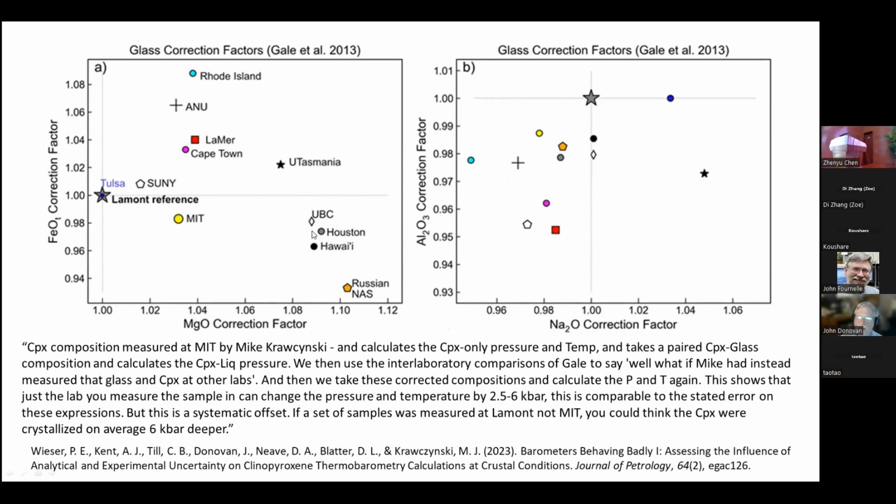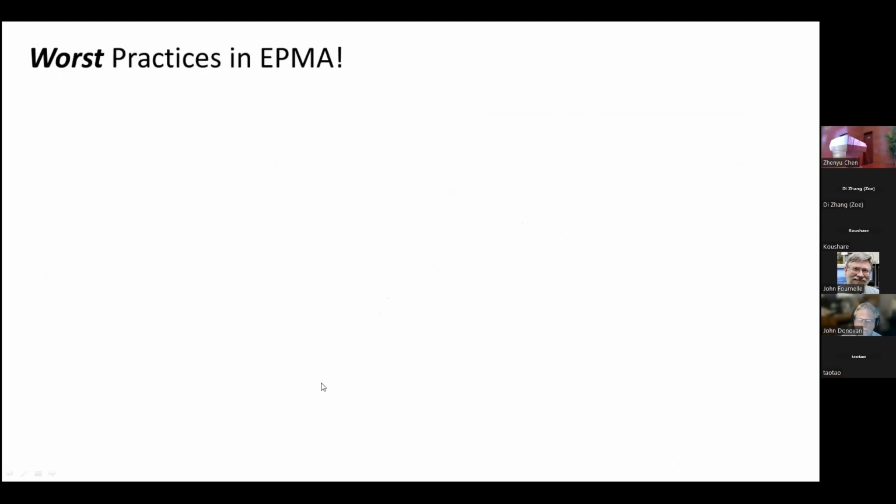Part of this is standards, part of this is dead time corrections, part of this is matrix corrections, and part of this is other aspects. And I will talk about some of this. But before we go on to best practices, I'd like to talk for a minute about an example of worst practices in EPMA.